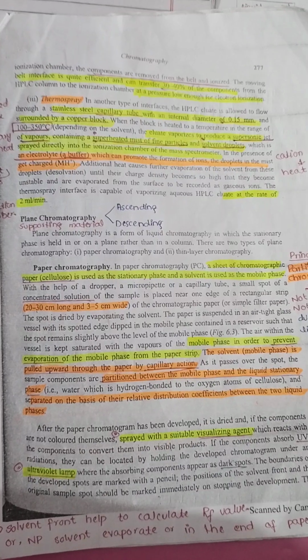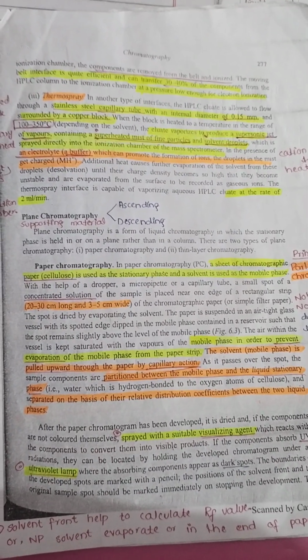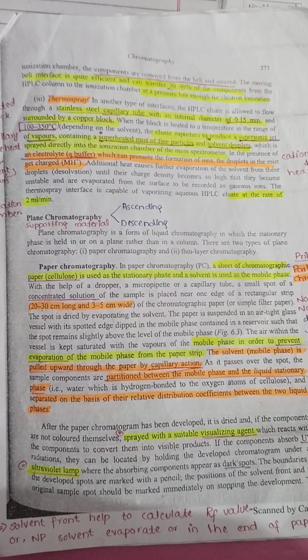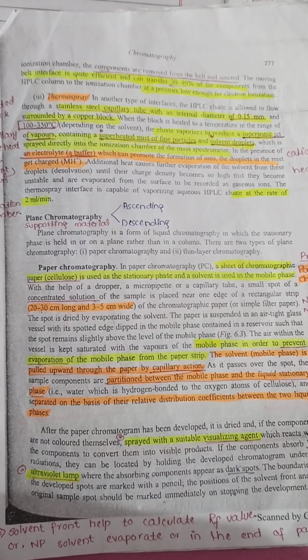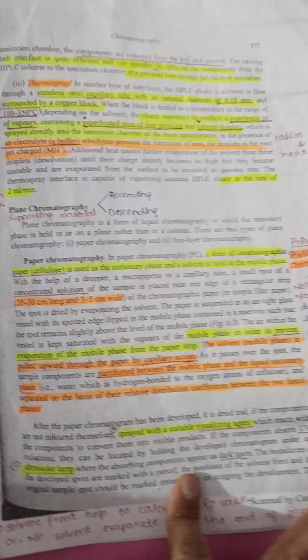If we discuss paper chromatography, it means we use a paper such as a filter paper or a cellulose paper as a stationary phase in a suitable size, for example 20 to 30 centimeters long or 3 to 5 centimeters wide. We use it as the stationary phase, and a solvent is used as the mobile phase. Now we discuss the working of it.